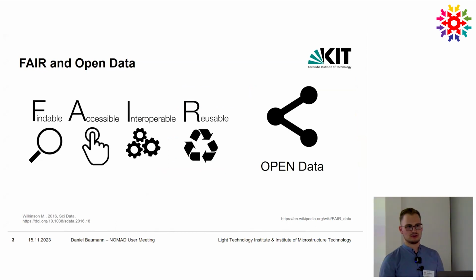We've heard about this today already. We mainly want data that is structured and findable, which means we have a unique identifier to really find our data.